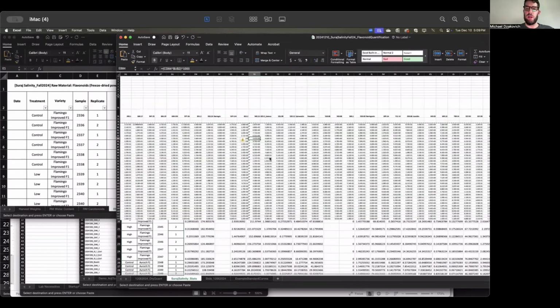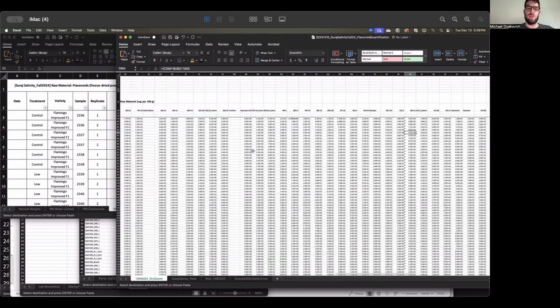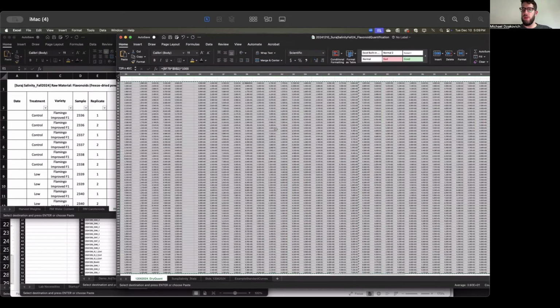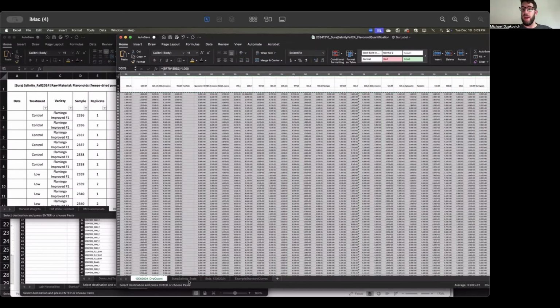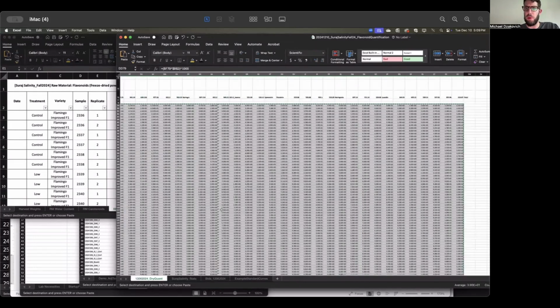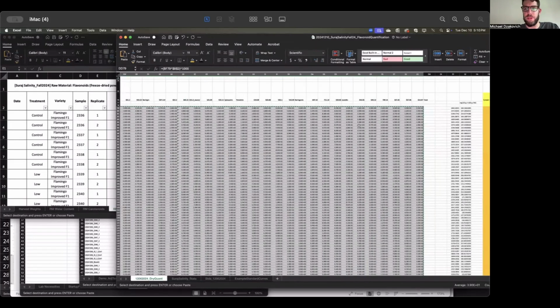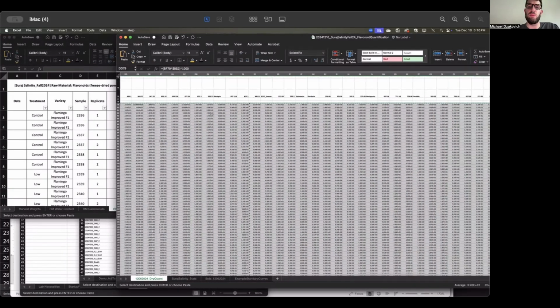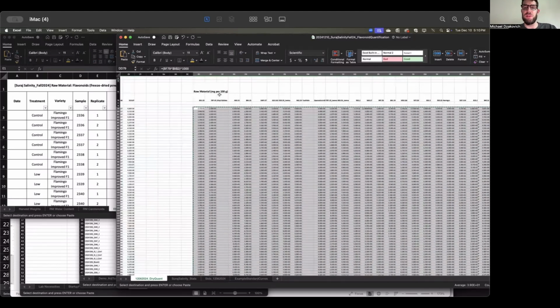And so what I did was I went into here. I essentially just selected all of these values, copied them, and then pasted them as values, because again, there's equations built in, so we just want the numbers. One thing to bear in mind is we might modify the template in the future so that it doesn't have this, but we don't want to include naringin or naringenin because those were internal standards that we added. There's also some vestiges from some other things, like there's ethyl gallate here. We can get rid of that.